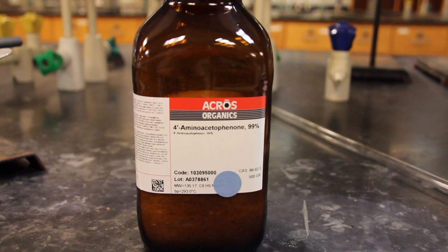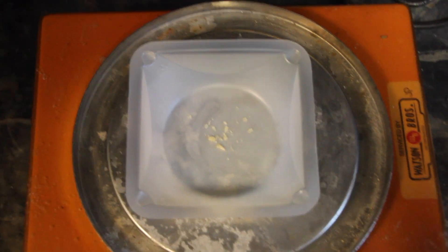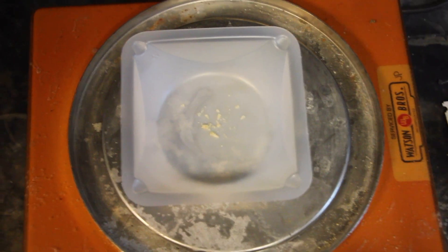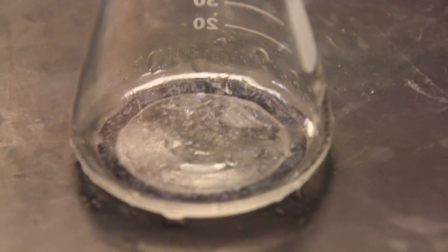You will now recrystallize 4-aminoacetophenone in a suitable solvent. A good recrystallization solvent should be able to dissolve a high quantity of a target substance near the solvent's boiling point, but only a small quantity near 0 degrees Celsius.